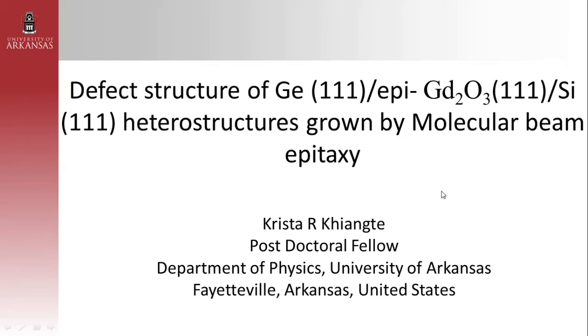So today I would like to give a talk which consists of the applications of reflection high energy electron diffraction, X-ray diffraction, and transmission electron microscopy for structural and mainly for defect characterization of epitaxial heterostructures. As I said, the topic may be very specific, but I hope this will help you correlate the TEM results with other techniques.